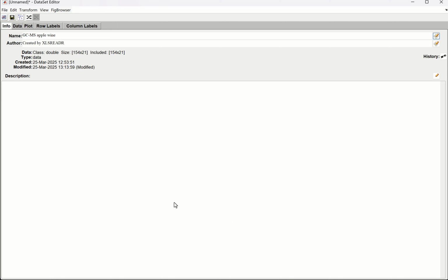The important point here is that, well, actually these curves look nicer here, but the main point is, there's a sample here that has a 0 concentration, but all of these are above 0. They're below limit of detection, but we're still quantifying them. And this is potentially very important. In many cases, when we do untargeted analysis, we're looking for patterns in the data that are indicative of some things. And the absence of an analyte in a sample can be indicative of certain things. So having accurate quantifications, even at low concentrations, can be important. In any case, it's hard to argue that it's better not to quantify them. Anyways, we do quantify all chemicals in all samples.